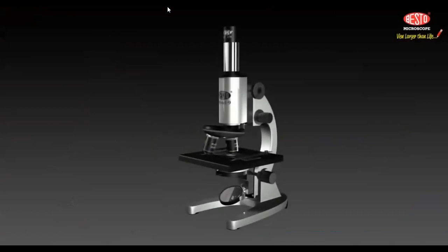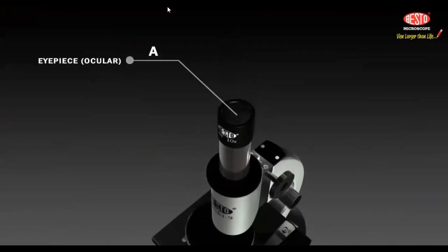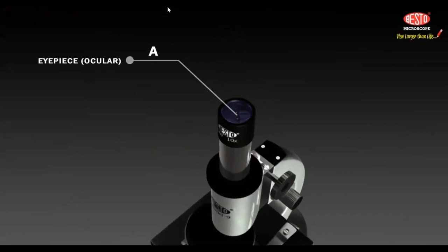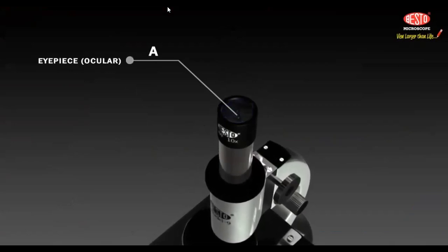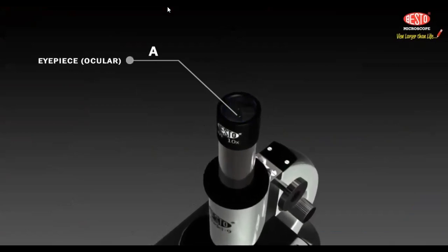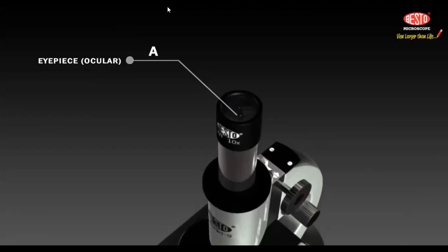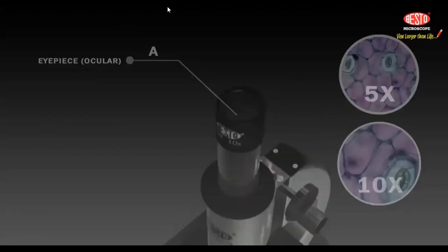A. The eyepiece, ocular, is the part of the microscope closest to your eyes, through which you look. It contains the ocular lens, which makes the image produced by the objective lenses larger. An eyepiece may be labeled with its magnification or power, for example, 5x or 10x, meaning it enlarges 5 times or 10 times.